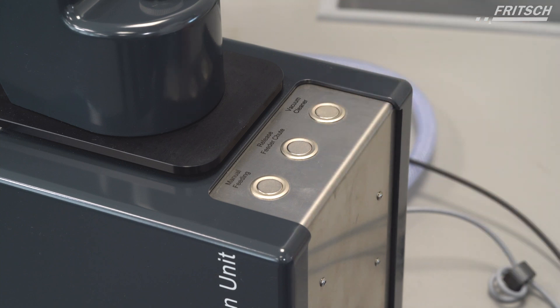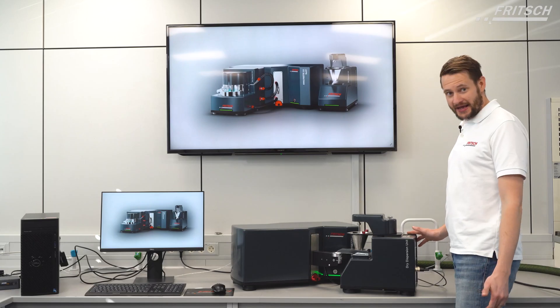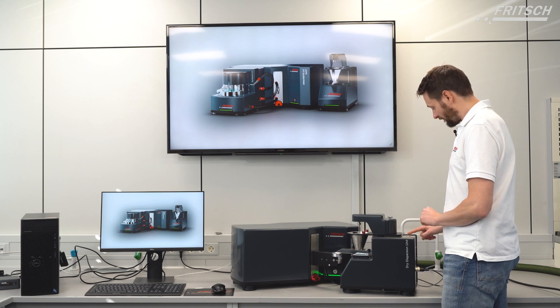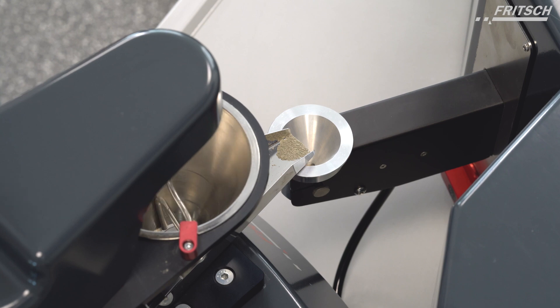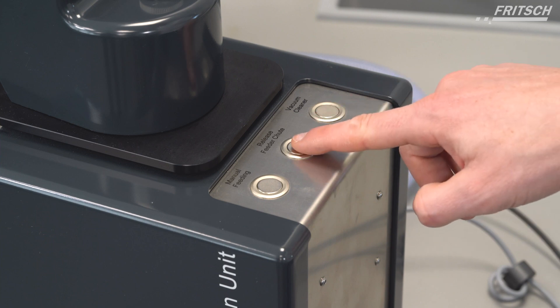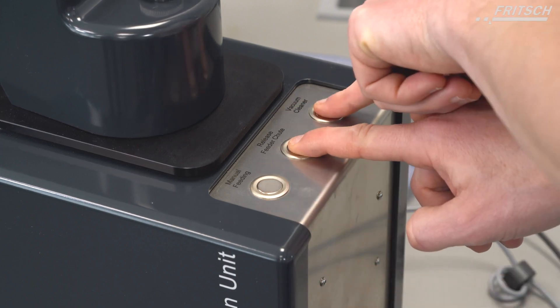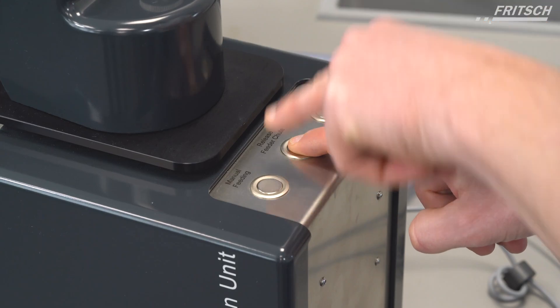And of course, there is the vacuum cleaner button to switch on the vacuum cleaner. In case you have any sample left on the feeder which you want to get rid of, you push the vacuum cleaner button and then hit manual feeding. But there's more to those three buttons than you would guess at first sight — once you press the release feeder chute button, you can control the height of the funnel going up and going down.